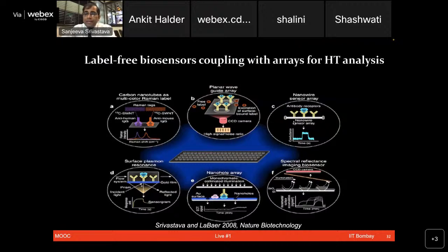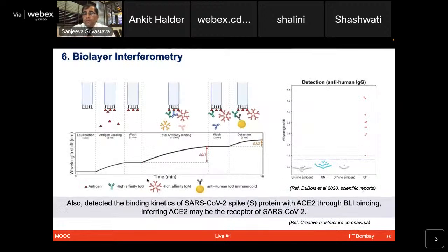How to take some of these interactomic technologies to generate more kinetic information, not only that an interaction is happening, but also to look at the on rate, off rate, the strength of the binding, and the kinetics values. There are many platforms emerging, especially surface plasmon resonance, which has been one of the key platforms for label-free biosensing. But additionally, new technologies are emerging, and one very promising technology is the biolayer interferometry-based approach. We are now going to take a live session from the lab about octet technology from Shalini.